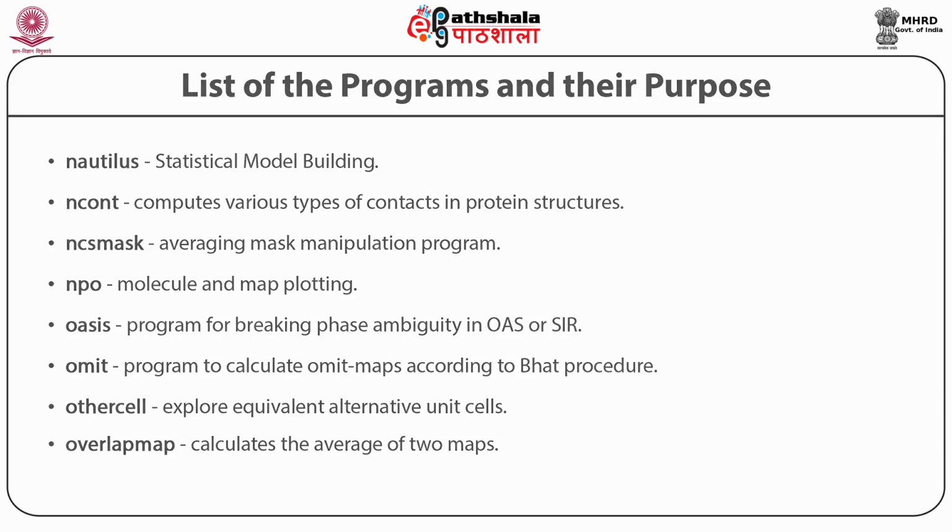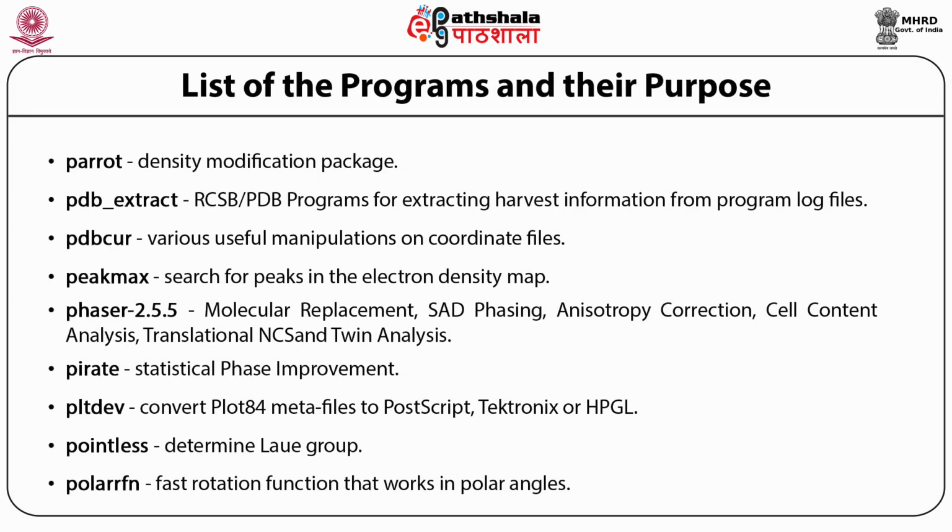Again, we have a program for density modification package called Parrot, and we have the important program called Phaser for doing molecular replacement, single wavelength anomalous diffraction phasing, anisotropic correction, cell content analysis, translation, non-crystallographic symmetry, and twin analysis. It's a very big and important program.